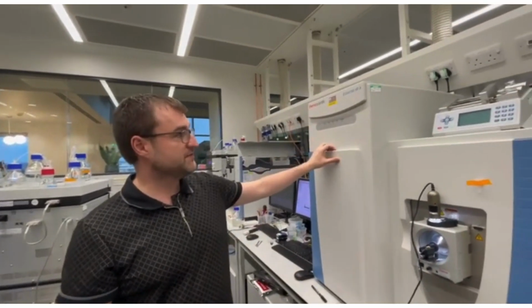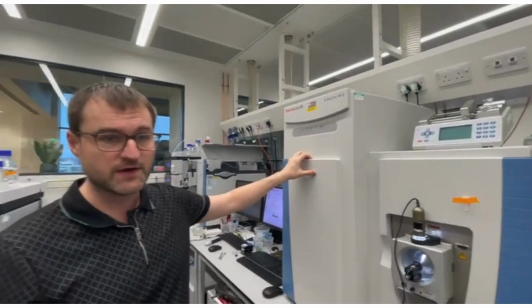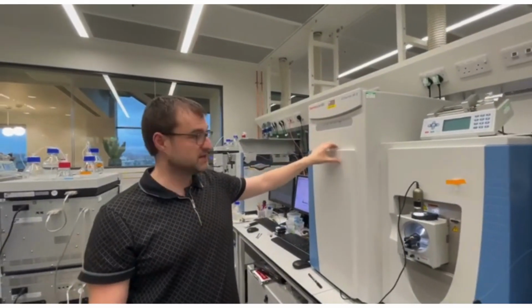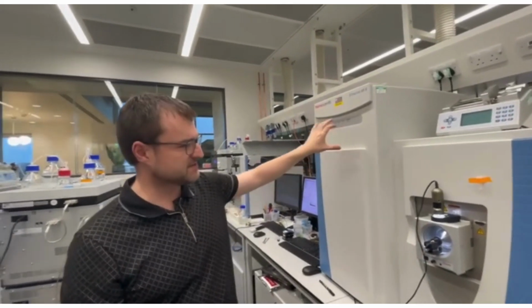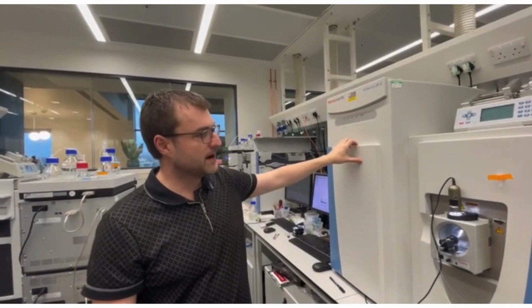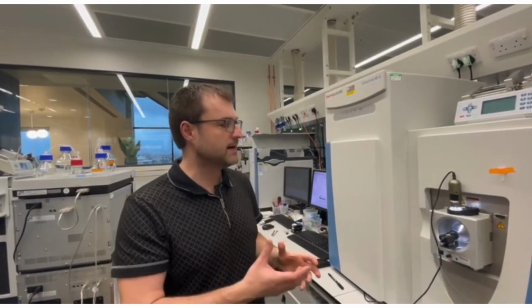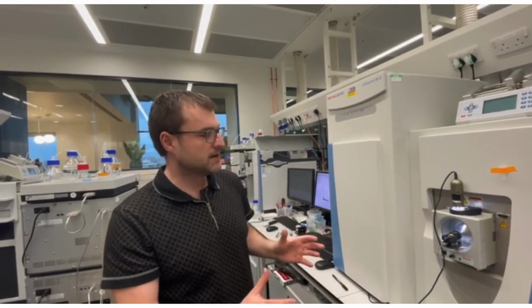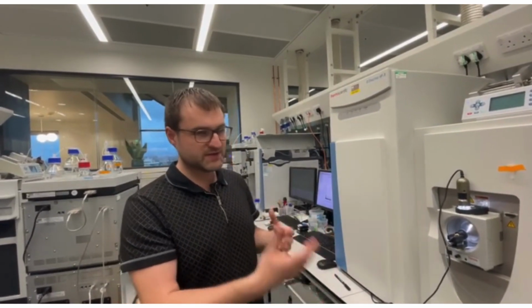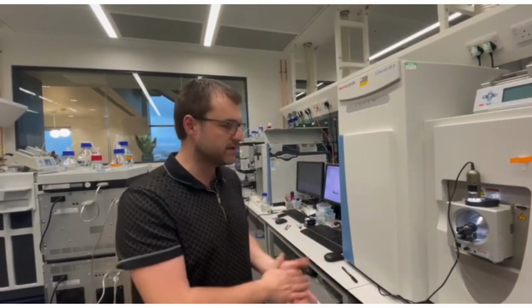These are Q Exactive HFX systems. They are all high-resolution Orbitraps with very good quadrupole isolation. This one is the oldest one. It produces fantastic data, but it has a convoluted ion path geometry that makes it hard to clean, it gets dirty very fast, and it needs many, many pumps to maintain vacuum. So over time, it's not that robust. One pump breaks, then another pump breaks, you have to take it apart, clean it, call engineers and so on.